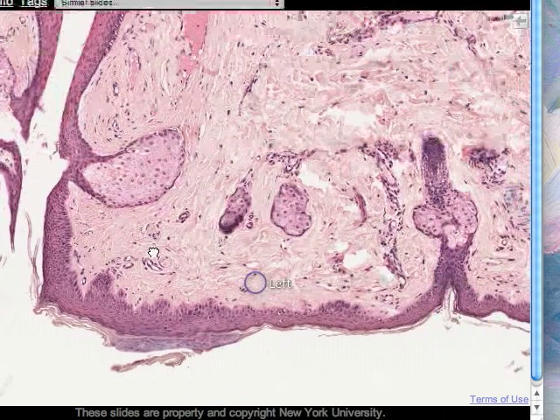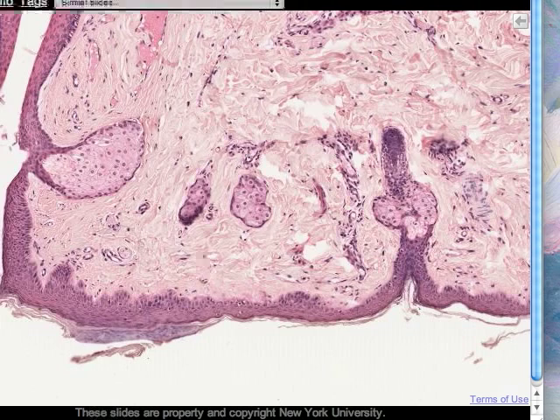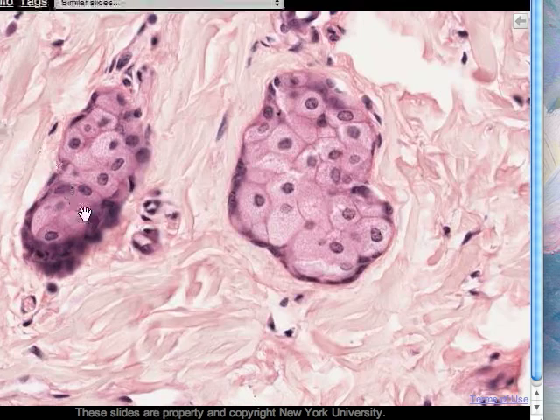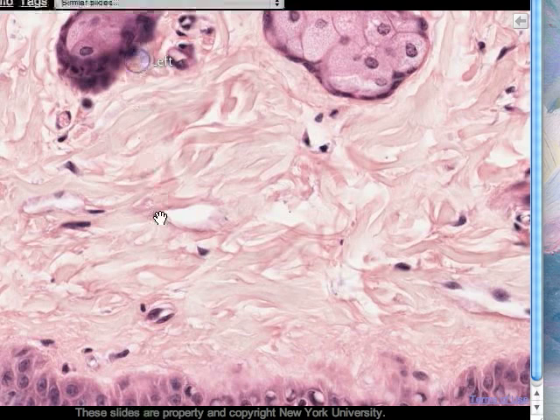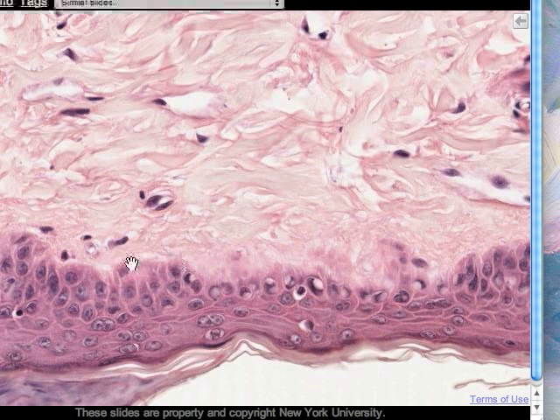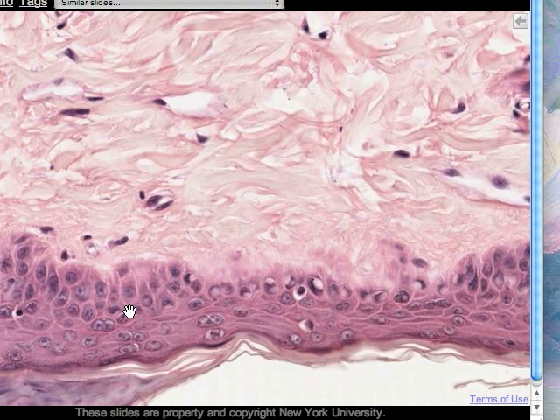If we look now beneath the epidermis, the epithelium of the skin, we cannot see the basement membrane. It is expected to be present but doesn't stain using this technique. It would be found along here, separating the overlying stratified squamous keratinized epithelium from the underlying connective tissue.